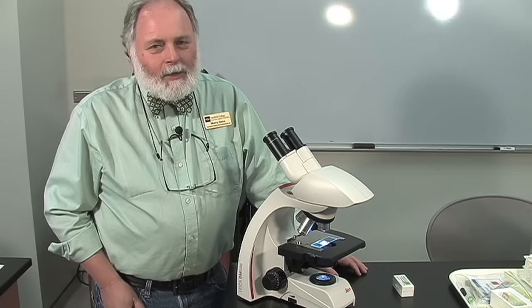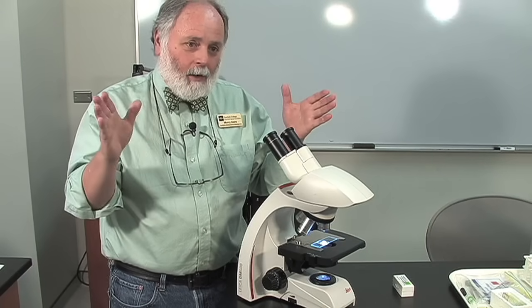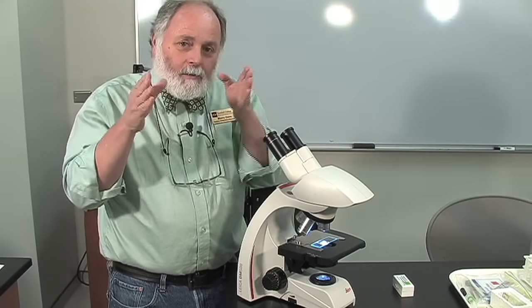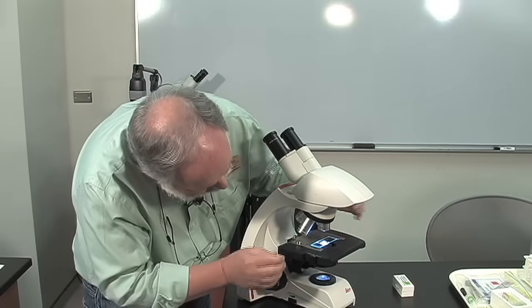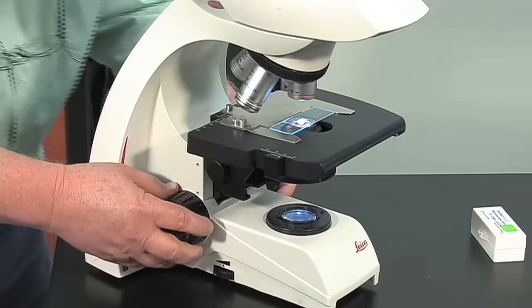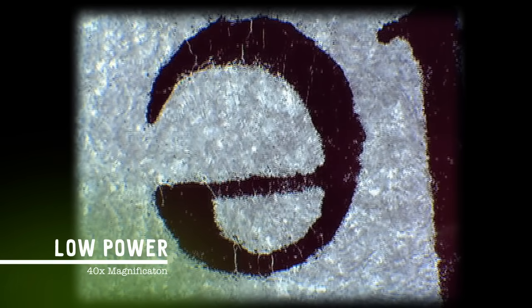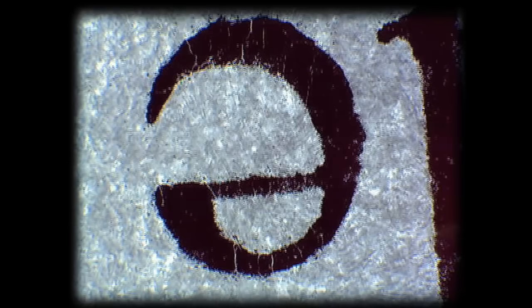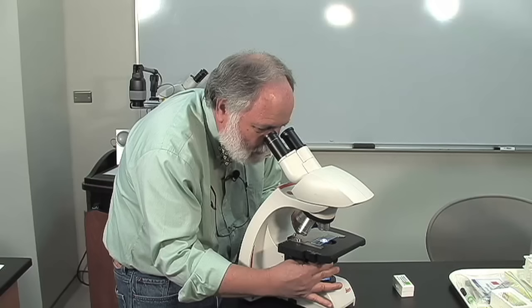When we get ready to focus the image on the microscope, we're going to start with low power. We start with the low power objective because it has the largest field of view — we're going to see more, which means we can find what we're looking for. First, with the slide on low power, we're going to bring the stage all the way up until it stops. Then I'm going to look through the eyepieces and turn the coarse adjustment knob away from me until I get the image into focus. Then I'm going to use the fine adjustment knob to really get a sharp focus. Now is a good time to use your diaphragm to adjust the light — sometimes turning the light down just a little bit will let you see a lot more detail.